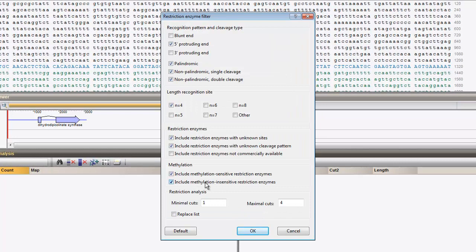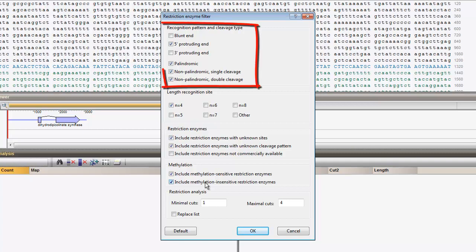We can, for example, uncheck Blunt end and 3-accent protruding end and leave all other options checked.